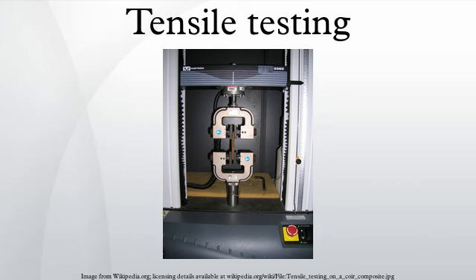Tensile specimen. A tensile specimen is a standardized sample cross-section. It has two shoulders and a gauge in between. The shoulders are large so they can be readily gripped, whereas the gauge section has a smaller cross-section so that the deformation and failure can occur in this area.